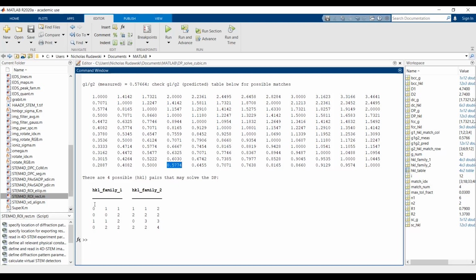Okay. So yes, we can get this first one to mathematically work. That one would work. The second one will not. The fourth one here is actually a linear multiple of the first, so we can just neglect this. This is actually just the same as the first result.